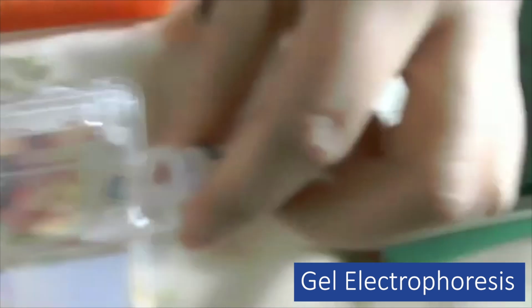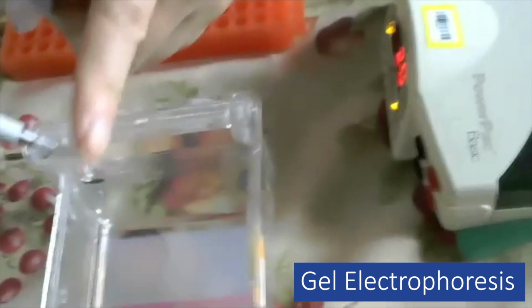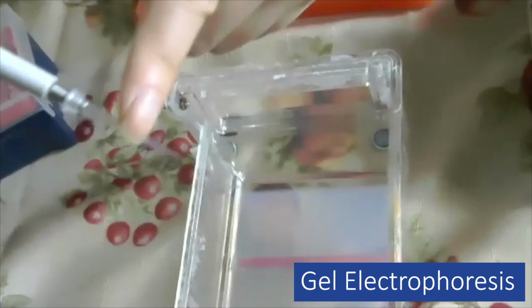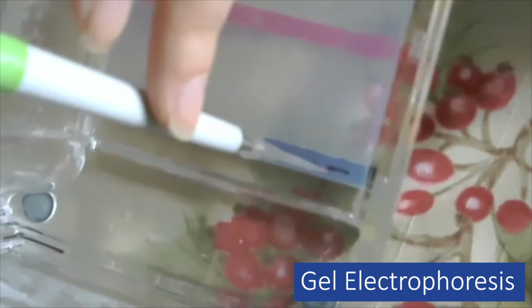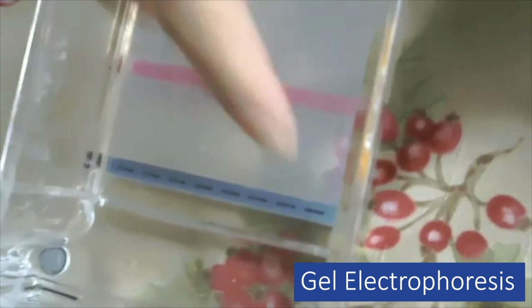Right, so this is the 100 bp DNA ladder, okay? I'm going to press down to the first stop, get into the liquid, release. Now that's 5 microliters. Can you see that? 5 microliters. All right, then you get into the well, okay? Press down only to the first stop. Keep pressing back out, okay? Then you've got 5 microliters.